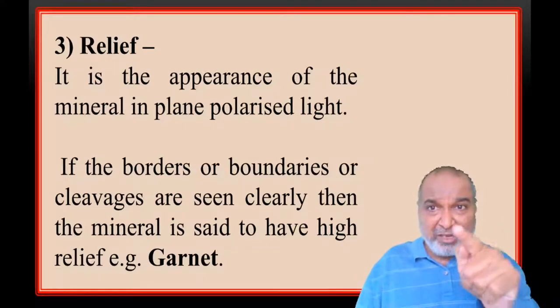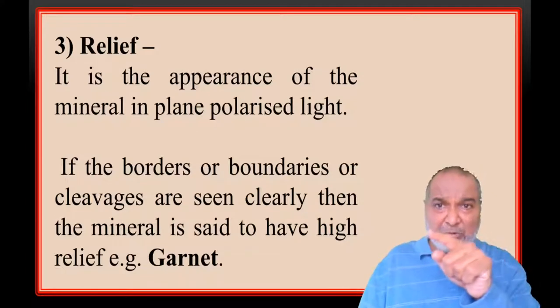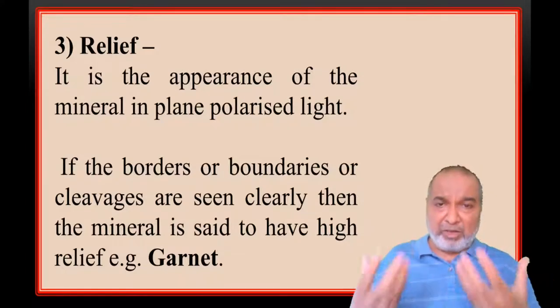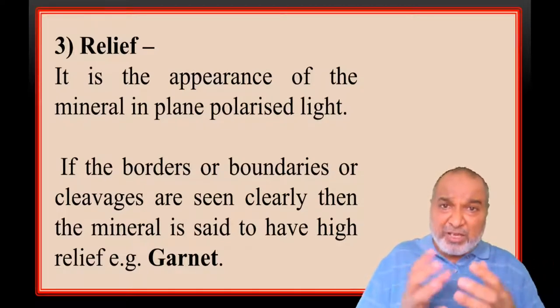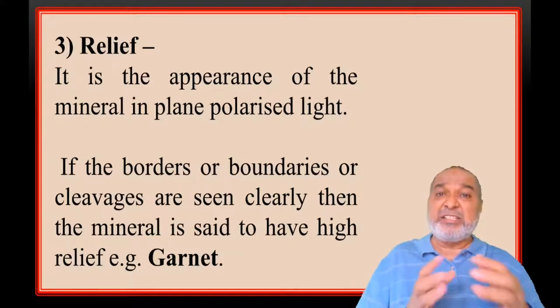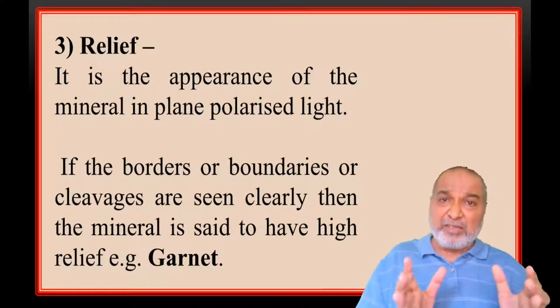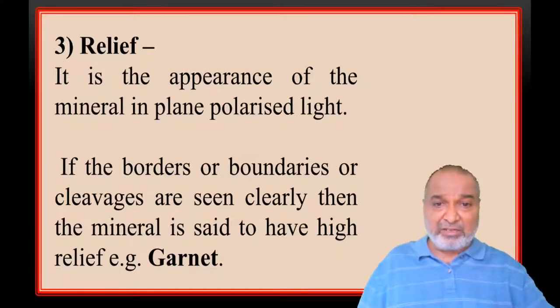So here what we have to concentrate on now is the mineral. If the outline of the mineral is not visible, the mineral is not clearly visible and we cannot distinguish it from the surrounding mineral, then it is low relief. But when it is clearly distinguished from the surrounding, then it is moderate, and if it is a very prominent one, it is high relief. We will see now.